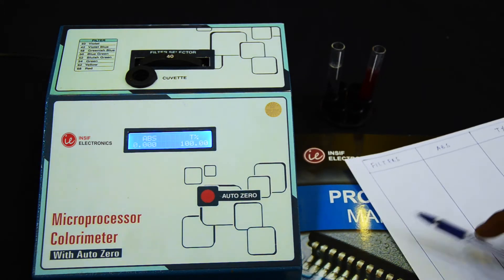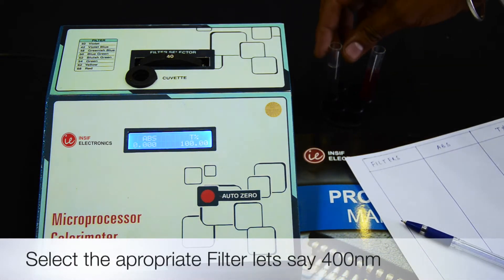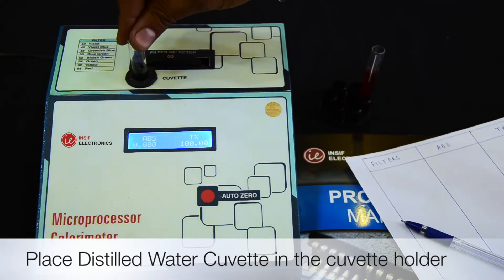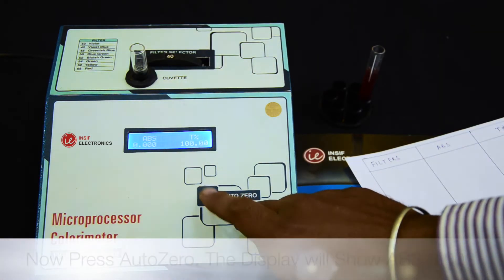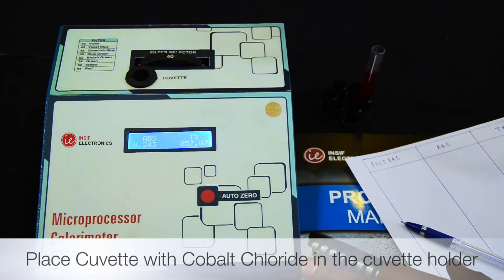Let's see how to operate. Select the appropriate filter, let's say 400 nanometers, and place the distilled water cuvette in the cuvette holder. Now press AutoZero, remove the cuvette, and place the cuvette with the sample to be tested.